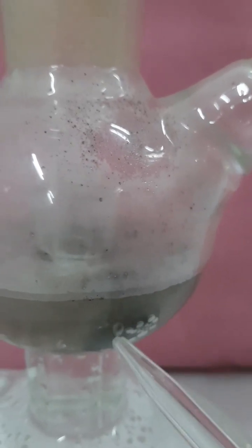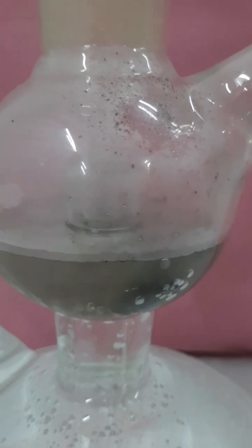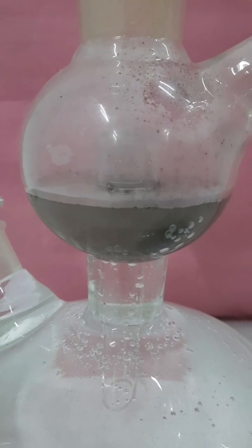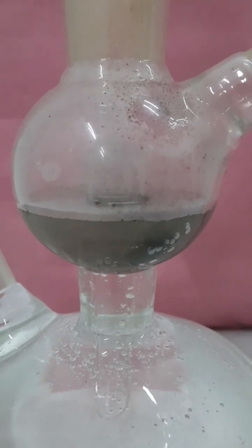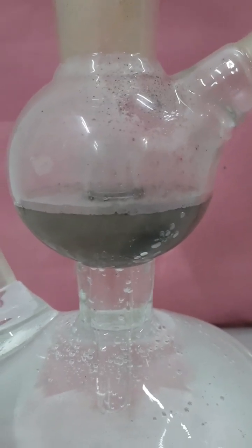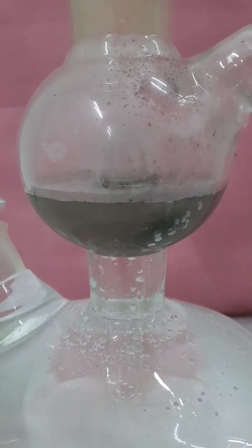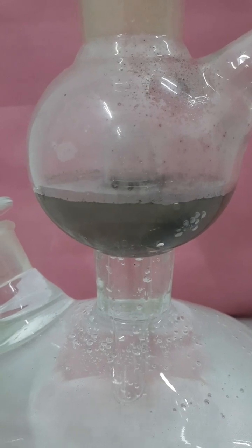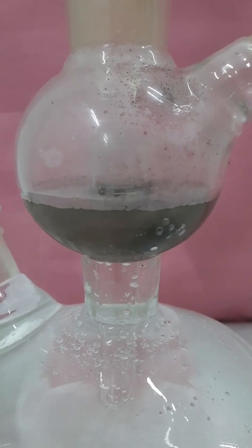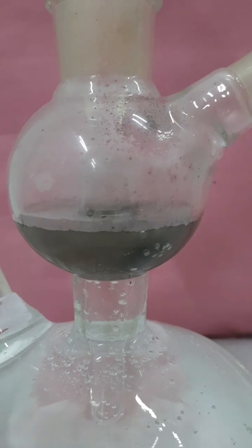Once the H₂S gas has been prepared or is being prepared, the pressure inside the middle chamber increases and pushes back the dilute sulfuric acid into the lower chamber. It exerts pressure on the surface of the acid, pushing it back and rising through the long tube into the first chamber. Contact between the dilute sulfuric acid and ferrous sulfide is removed, and hence the reaction stops.